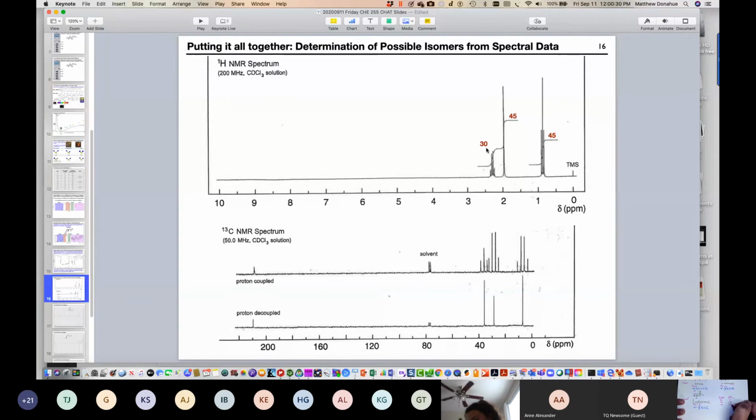So we really can't have decimals. We need whole numbers. So we multiply this by 2 because that's going to get us 2, 3, 3. Now look at these numbers.